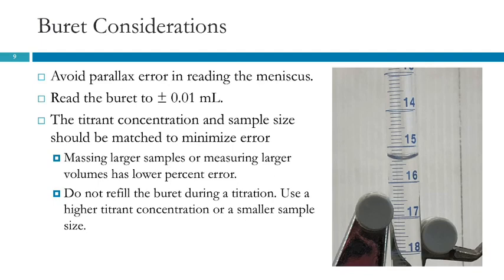We always want to include an estimated digit when we record measurements. And so we estimate the next decimal place. In this case, it's the hundredths place. And so you just kind of eyeball it, and you imagine 10 divisions in there. And, you know, you get two people measuring that, and they might give you different results. It's okay. It's uncertain.